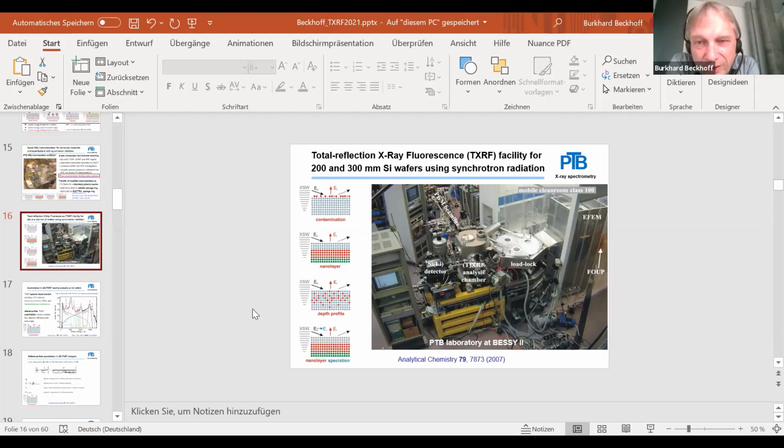The typical window was 135 nanometer polyimide with a 20 nanometer aluminum oxide plus a 20 nanometer aluminum coating, and those windows cannot stand atmospheric pressure. So we had to keep those detectors in vacuum all the time, which was a pleasure for calibration work. But we needed the windows to prevent the detectors from getting an ice layer. And this is the main part of the answer to your question.